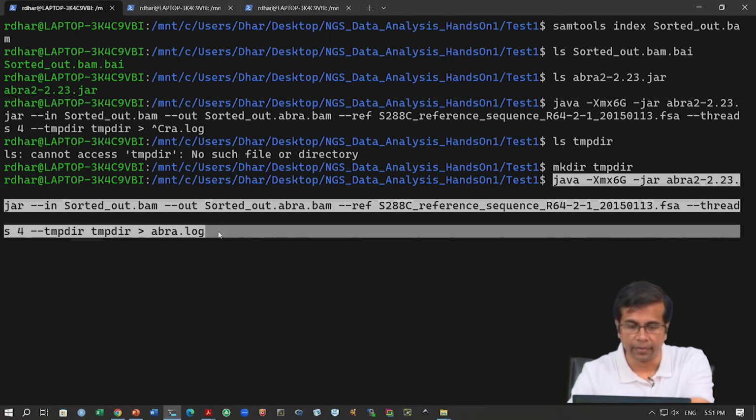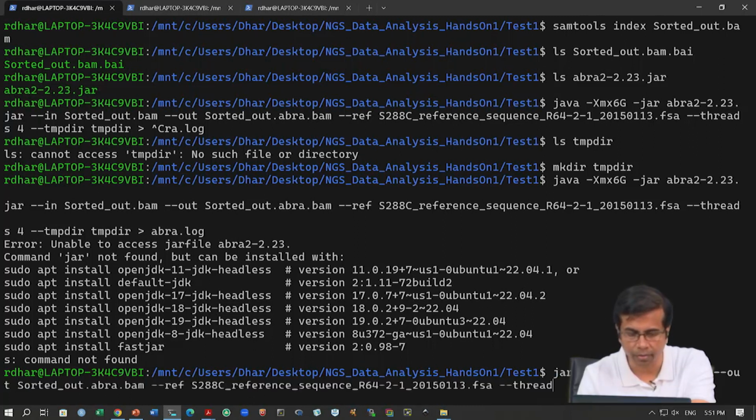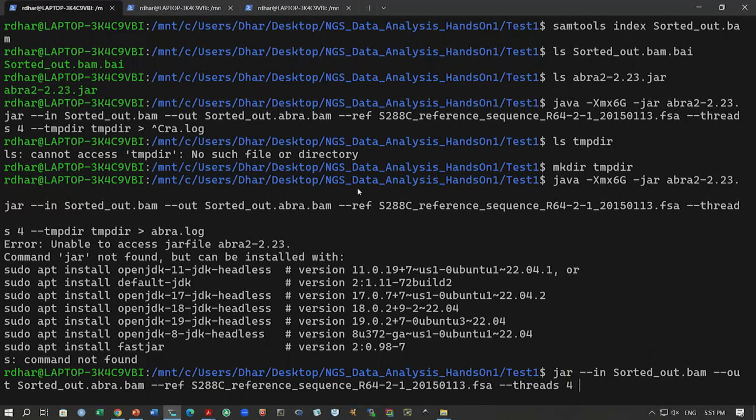Okay, so maybe during the copying it didn't work out very well. So I'll run it again. Let's see, threads 4.